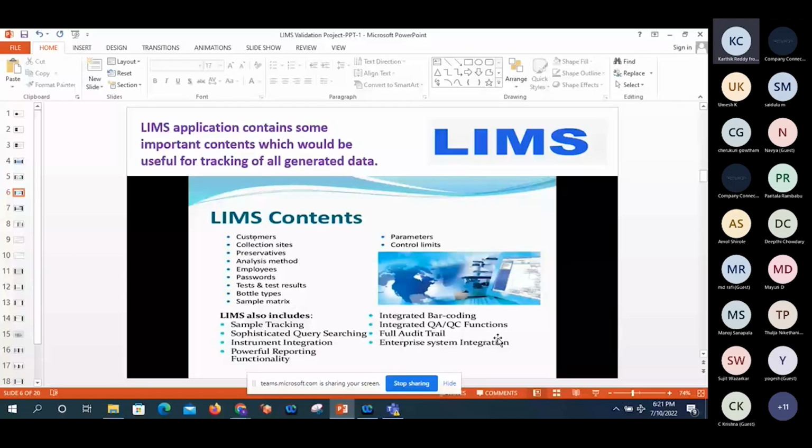LIMS can be easily integrated with SAP, for things like warehouse samples and finished product samples. From manufacturing, they can generate SAP inspection plans, writing things like material code, manufacturer name, and lot number. We can integrate those from SAP to LIMS.